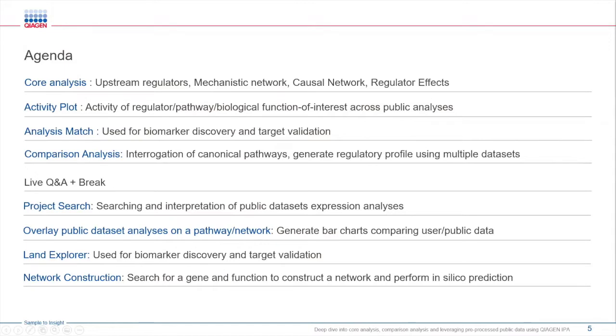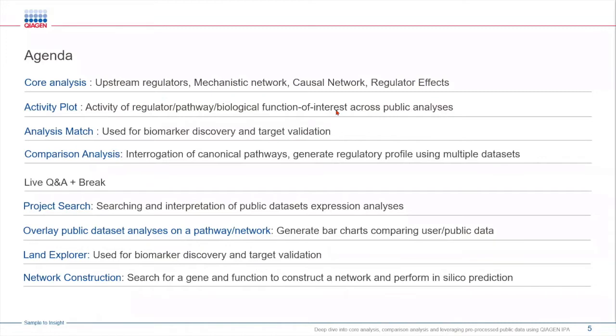Next we will look at the activity plot which provides a novel approach to identify key pathways or regulators by exploring its predicted biological activity across thousands of data sets which represent different disease conditions or drug treatments.